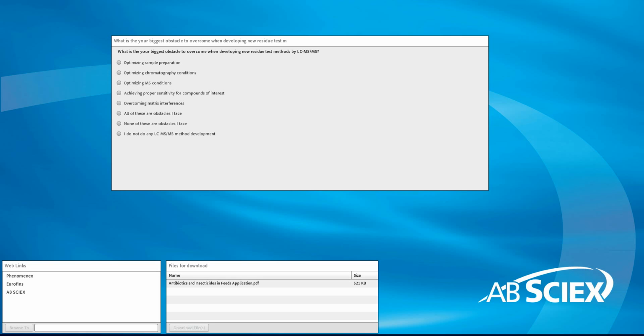You face all of those obstacles, you don't face any of those obstacles, or you're not doing any LC-MS method development at this time. So what are your biggest obstacles to overcome when developing new residue test methods by LC-MS? I'll give just another second or two to get some more answers to come in.